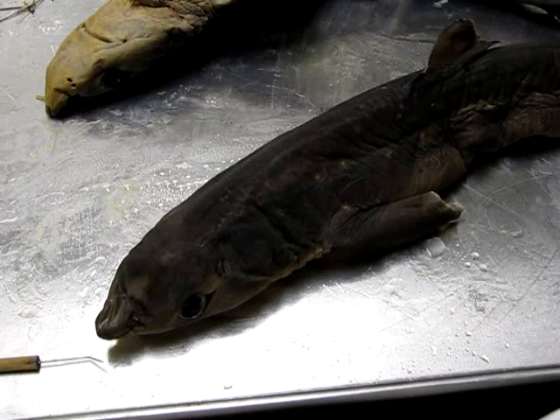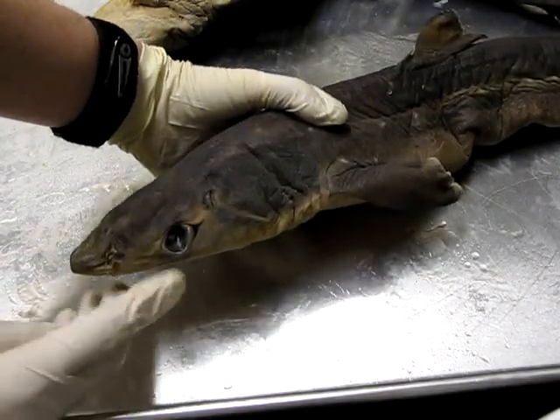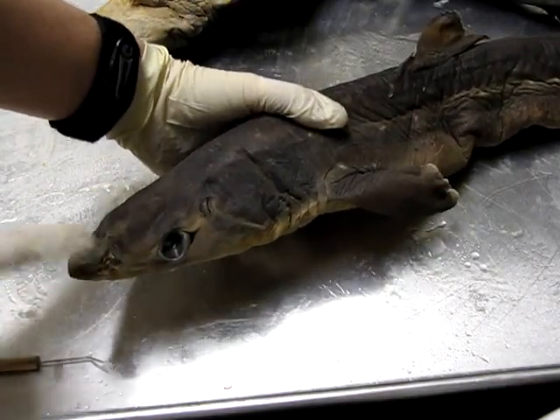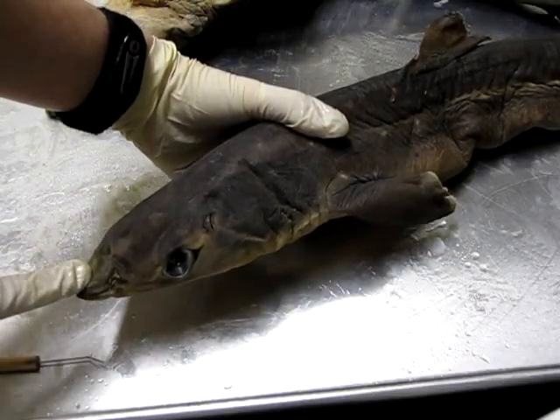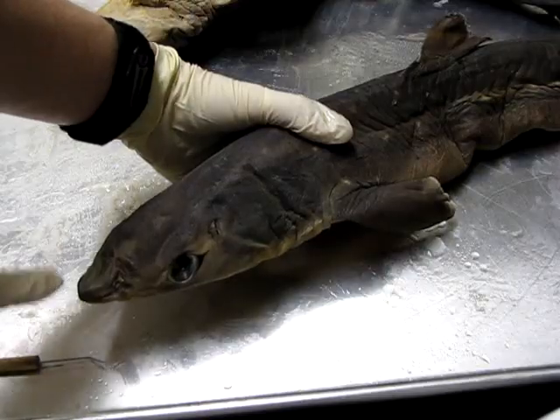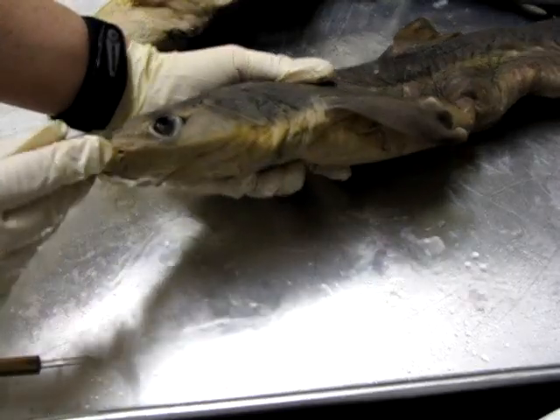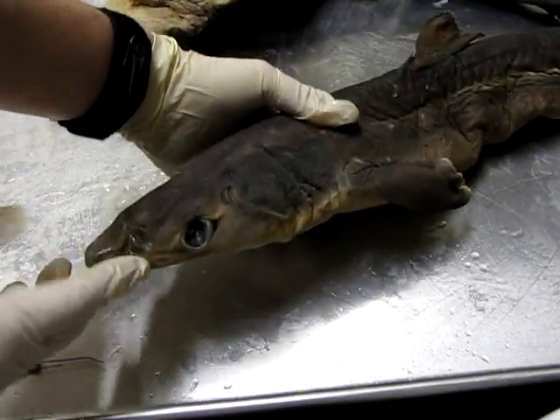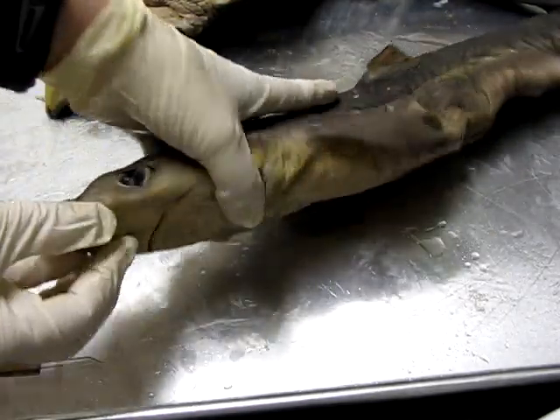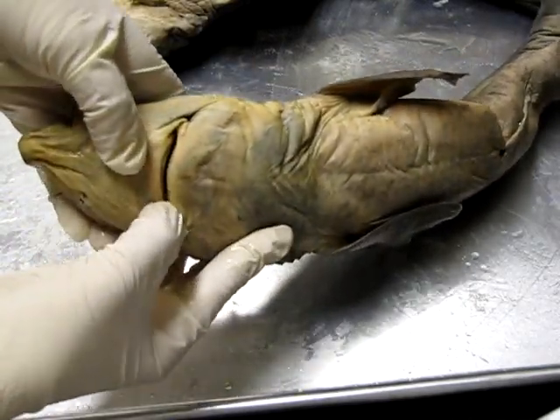Let's have a quick look at the external anatomy of this dogfish shark. A couple of obvious structures near the head: we have the eye here, the pointed area at the front of the face is called the rostrum. There are holes on either side of the face — here's one right here — that's the nostril.